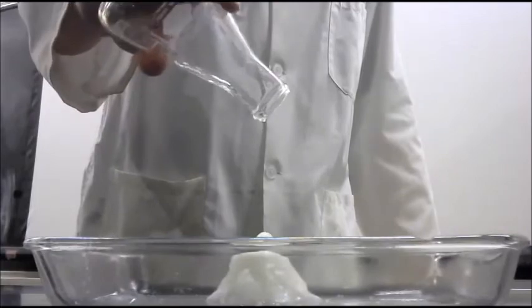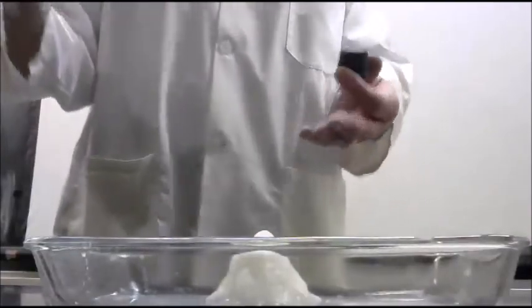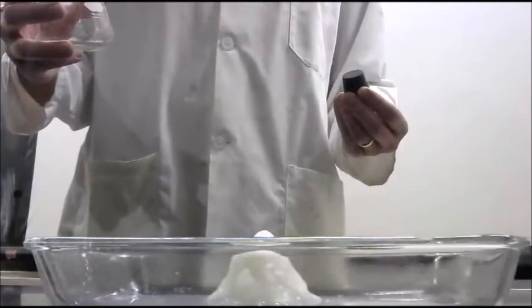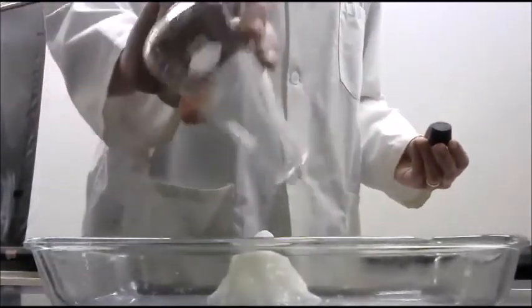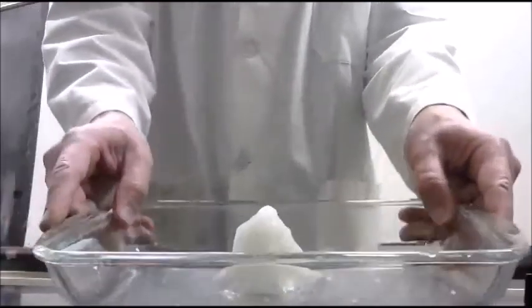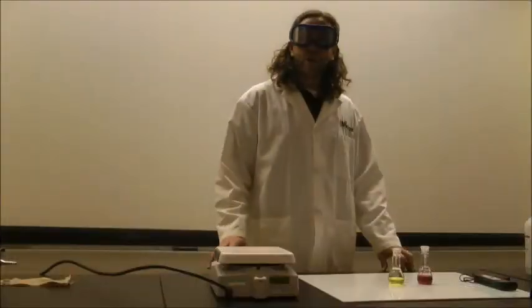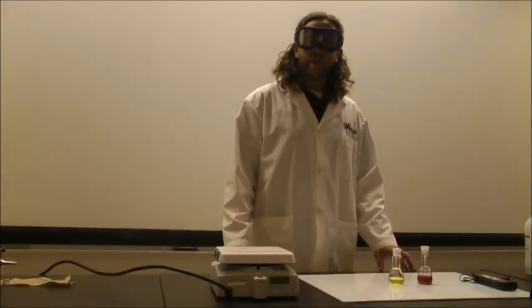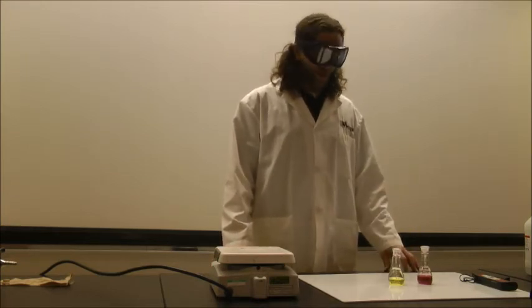So as you can see, as I pour this solution out, I put it onto crystals that were already in the tray that gave the pattern to the sodium acetate to form more crystals. So as I poured it out, you can see there's actually a very tiny amount of water, and the vast majority of what I have in the tray now is the solid sodium acetate. Chemists often get really excited about chemistry, and when we get the most excited, our molecules get excited with us.